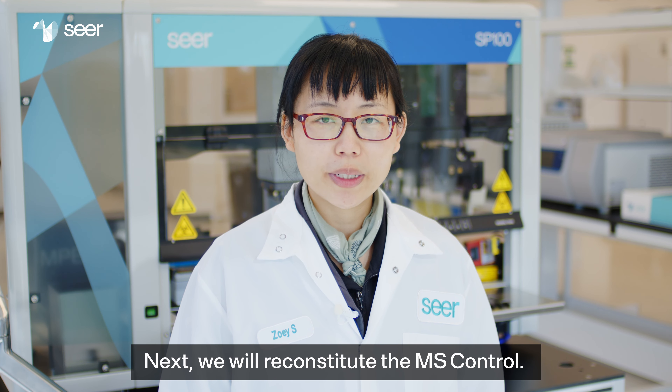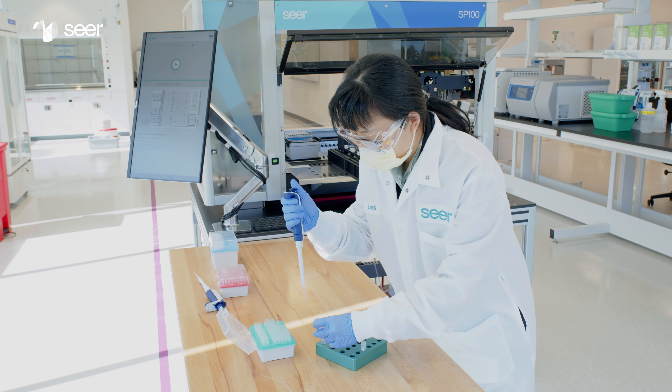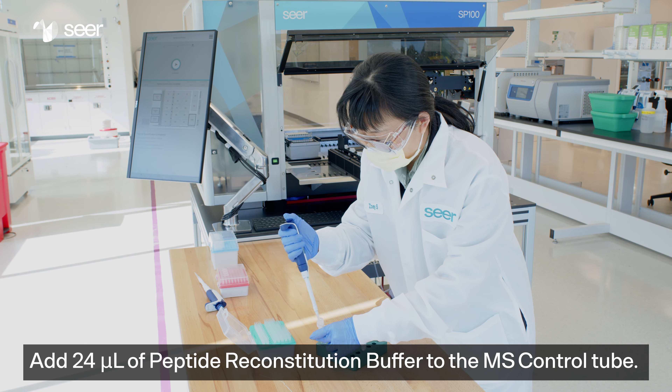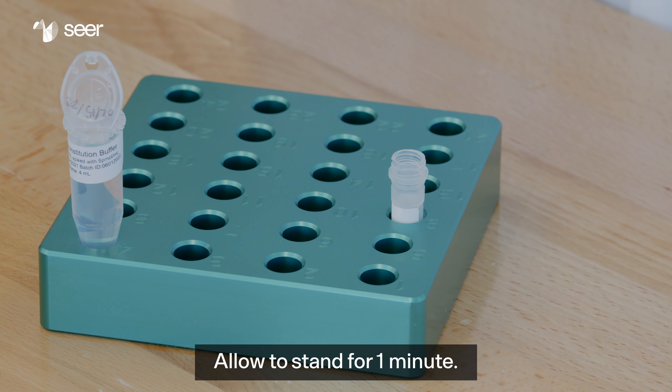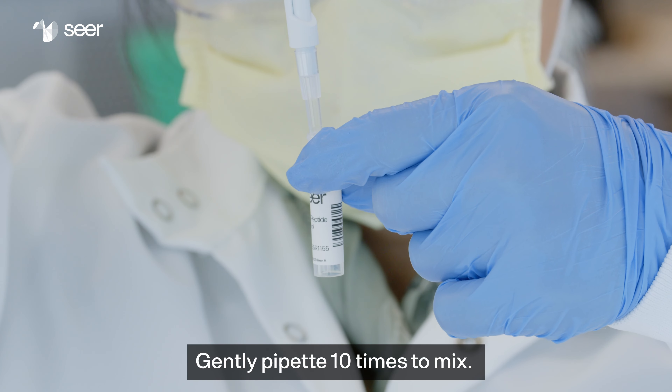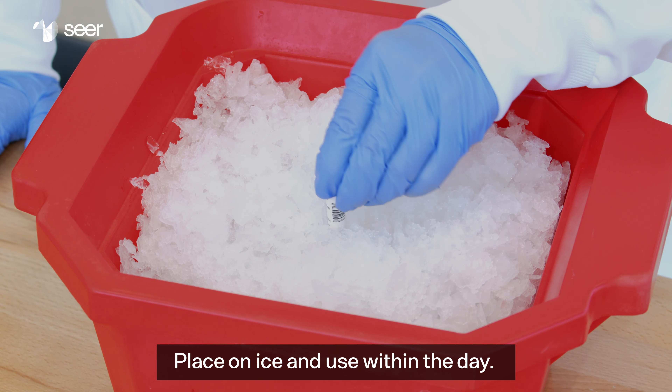Next, we will reconstitute the MS control. Add 24 microliters of peptide reconstitution buffer to the MS control tube. Allow to stand for one minute. Gently pipette 10 times to mix. Place on ice and use within the day.